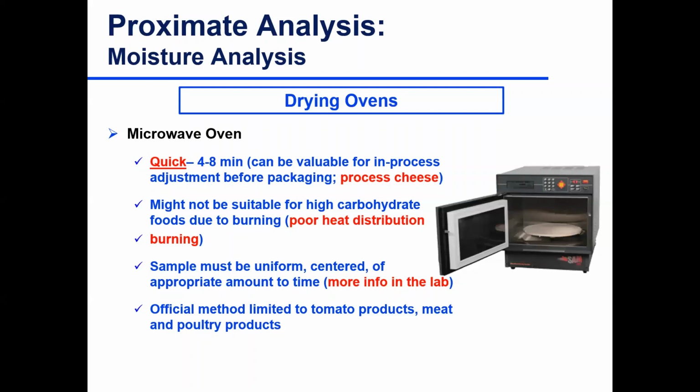And so there may be a bit of a problem in that, of course, we get heating. Some foods will heat more than others. The food can actually get fairly hot in the microwave oven, and that can cause some degradation to it. If there are errors in the system, poor heat distribution, wherever you've got something that absorbs microwaves, it's hot.